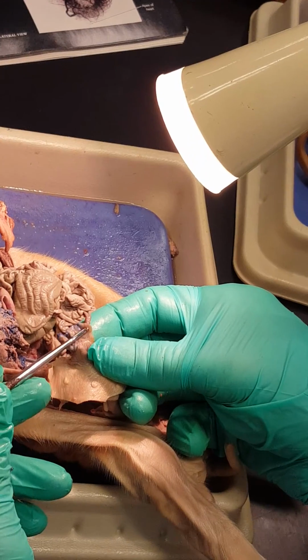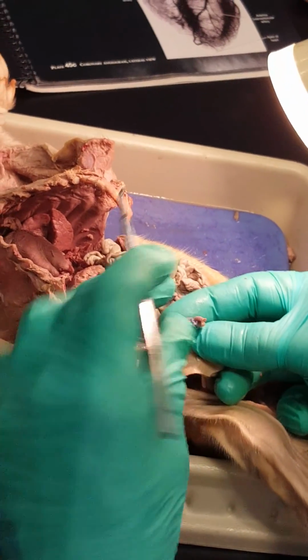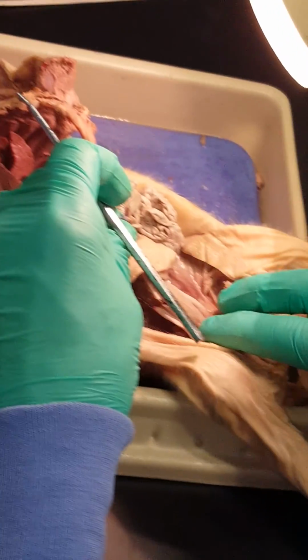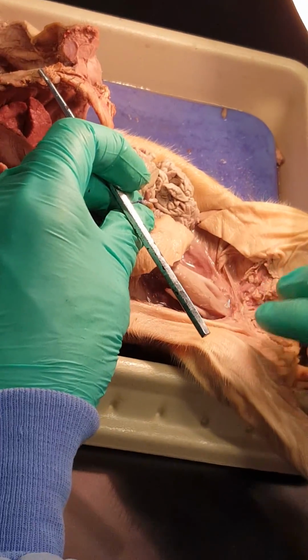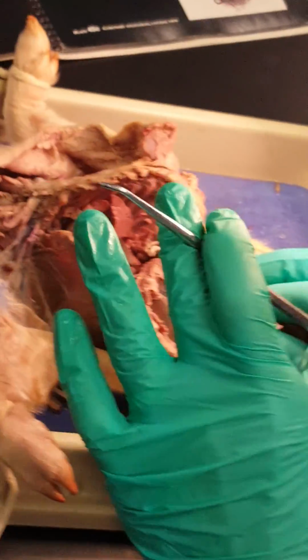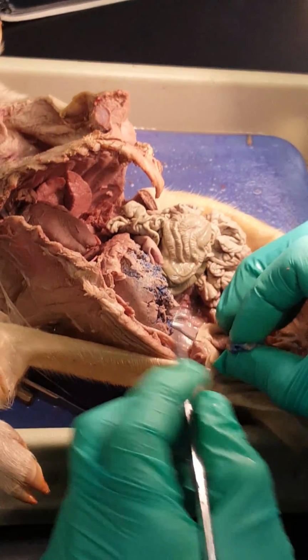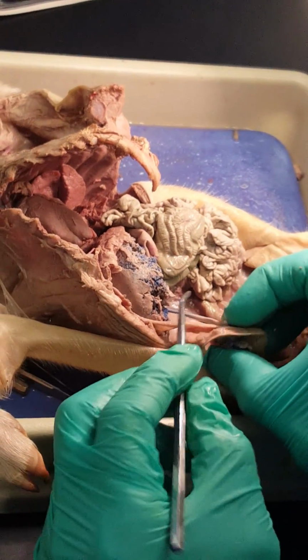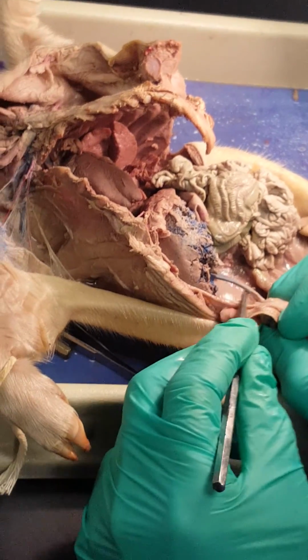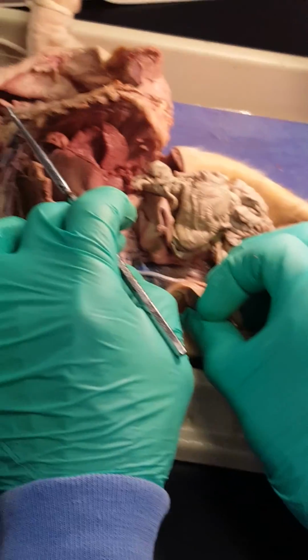What do you think that is? That's the umbilical cord. So remember, this is a fetal pig. These are called the umbilical arteries, and they're returning deoxygenated blood to the umbilical cord. It will travel a little ways to the placenta, pick up oxygen, come back through the cord, and then carry the oxygenated blood through this vein, the umbilical vein, which runs up into the liver.